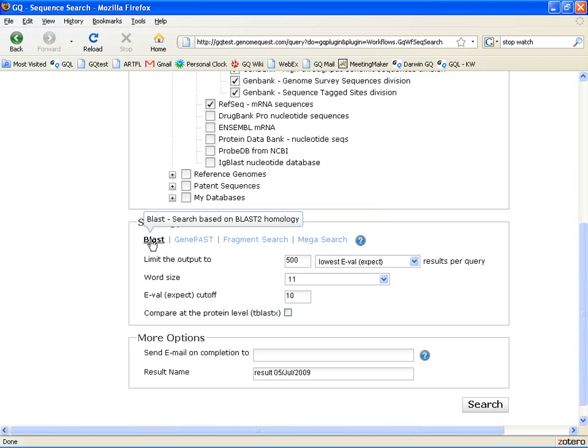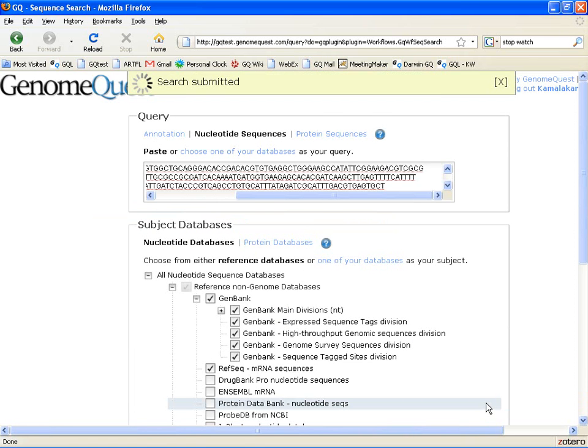So in this case, we'll run a BLAST search and click the search button.